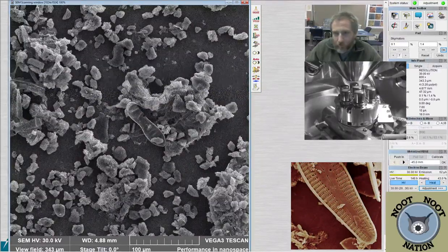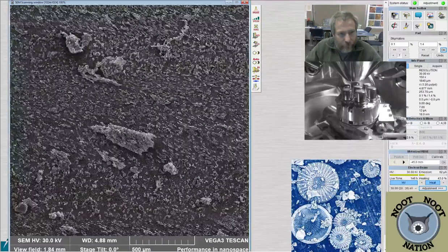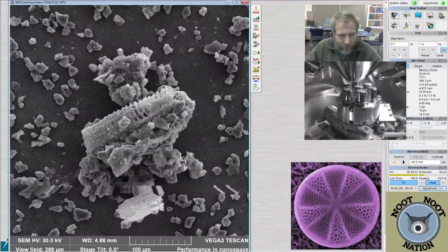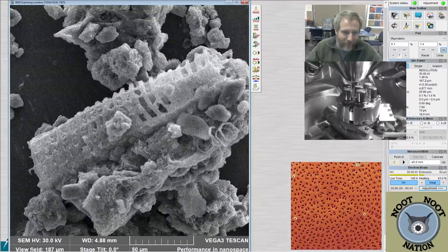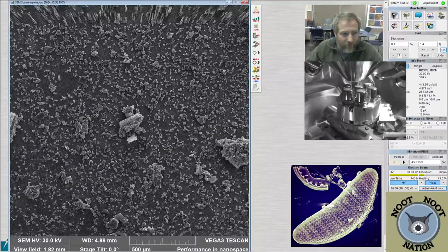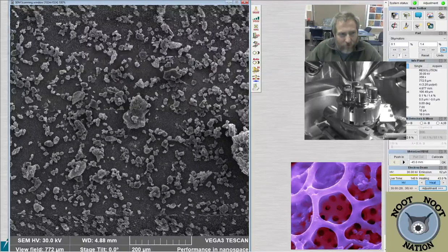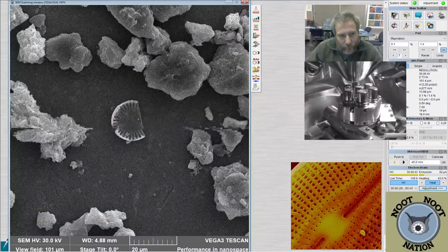And here's some more of those. This is the other Sorella. I know where we are in the slide, because that's where we were looking at the Pleurocera before. We drifted because I keep turning the stage. Kind of curious what this mass is here. I'm still not sure what that is. I don't know what that structure is. Not a diatom. I don't think that's a diatom at all. It's too big and also not the right shapes. Let's see. What's this? Cyclotella? Just a fragment of one.